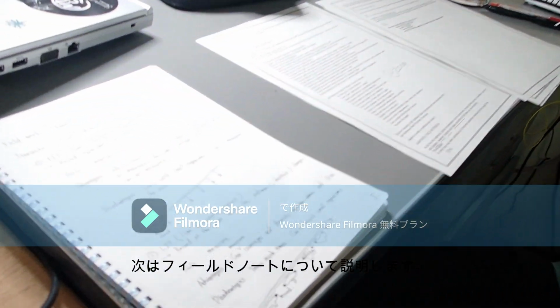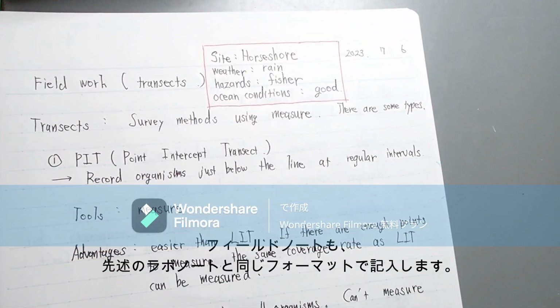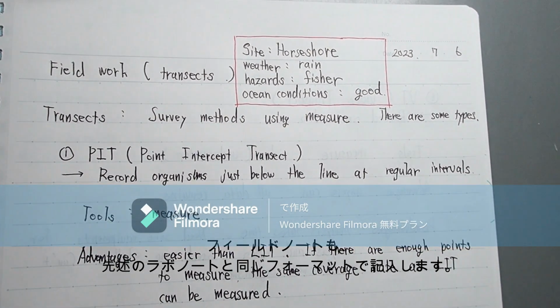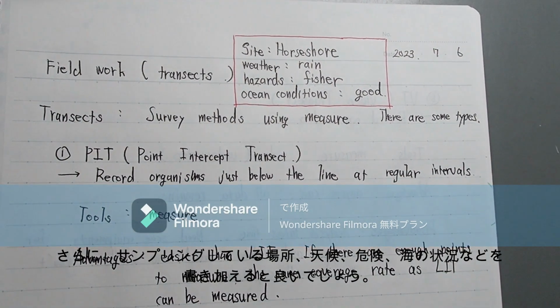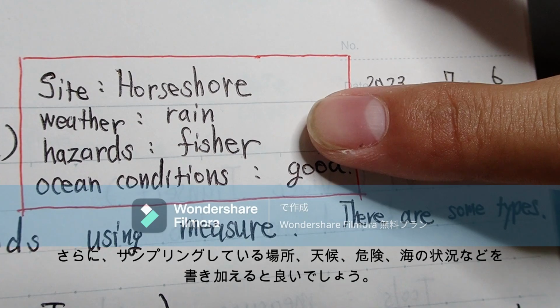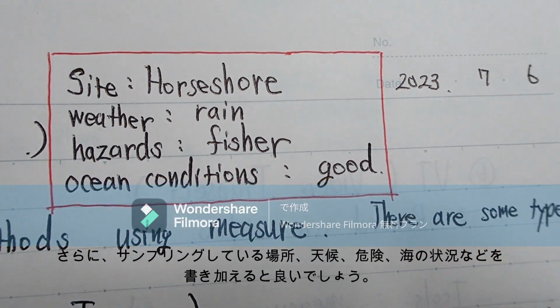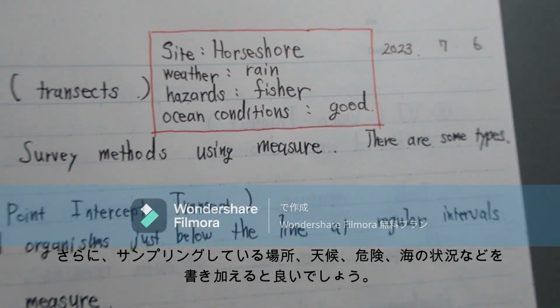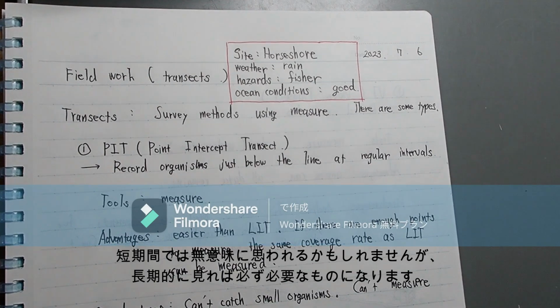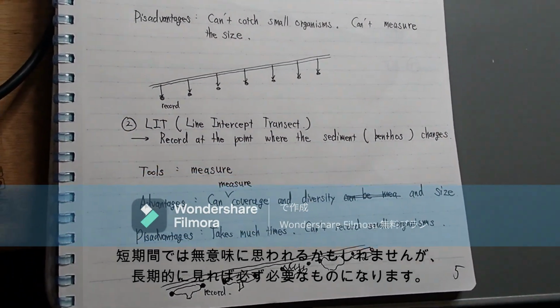Okay, I will explain about the field notebook. As for the lab notebook, similar considerations apply when it comes to field journals. In addition, you can add the sites, weather, hazards, and ocean conditions of the sites you are sampling. In short, these tips may seem pointless, but they become absolutely necessary during longer trips.